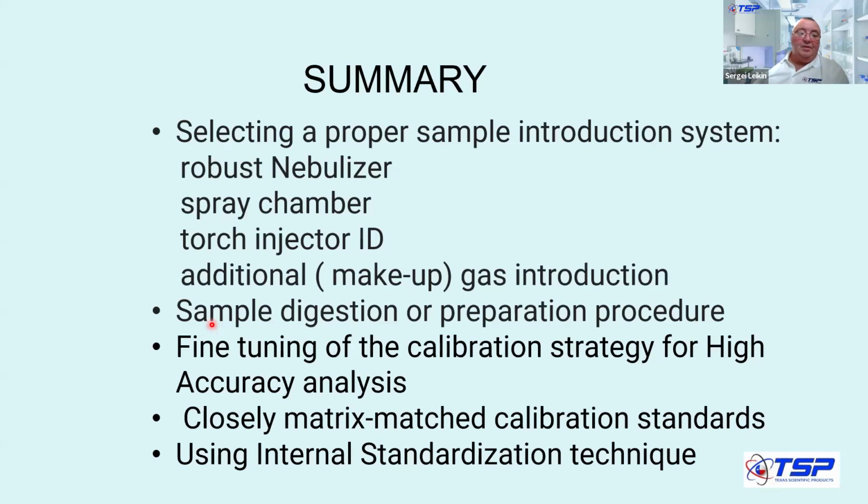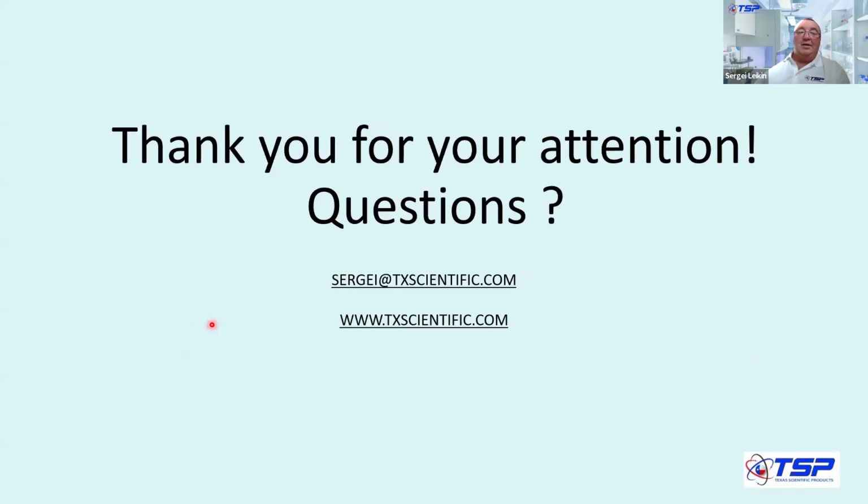One thing that I did not mention, and it's worth mentioning in the end, is of course using internal standardization. It's almost a must in all of these applications that I mentioned. So I would like to thank you for your attention. Questions, please, at the end. We're going to be very happy to answer them. And Mike, I'm going to be passing it to you.